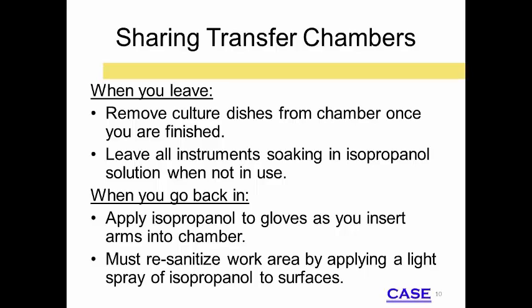If multiple groups use the same transfer chamber, members should observe sterile technique. Between steps and groups, instruments should be kept in isopropyl solution. Culture plates should be removed when you are finished. Every time someone enters the chamber, they should sanitize their gloves and the work area.